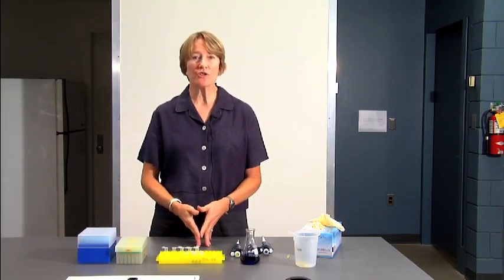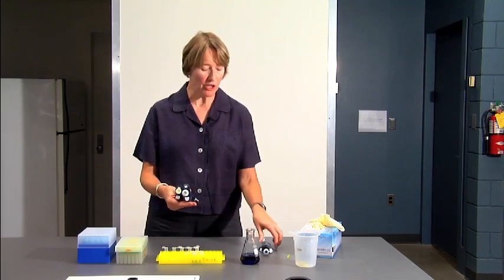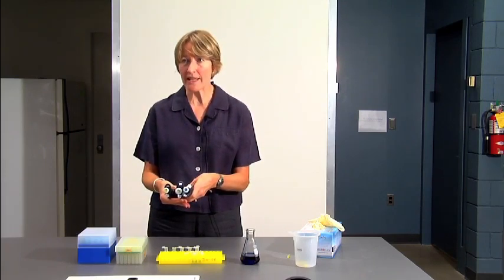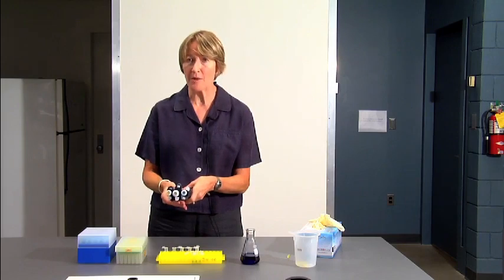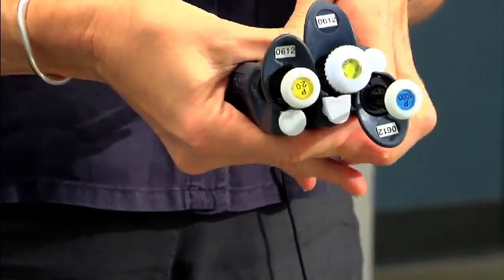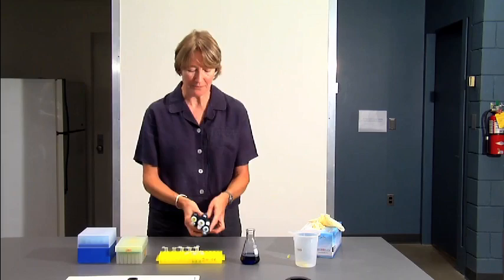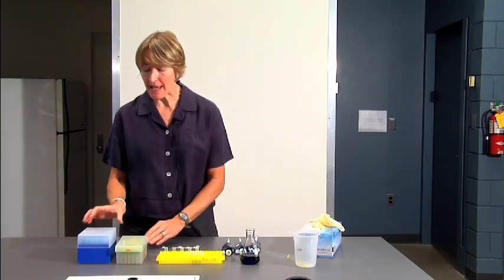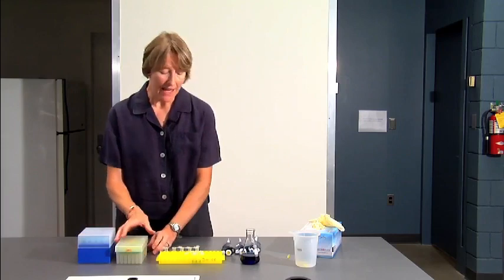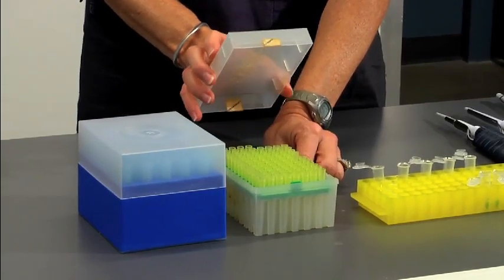Now I'm going to show you how to actually use the pipettes to measure a specified volume. I want you to notice that the pipettes are color-coded, and that on the top of the plunger, you'll see either a yellow dot. On the P20 and the P200, you have a yellow dot on the plunger. On the P1000, you have a blue dot. This color coding tells you which size and which color pipette tips to use. If your micropipette has a blue dot, you use the larger blue tips. If your micropipette has a yellow dot on the top, you use the smaller yellow tips.